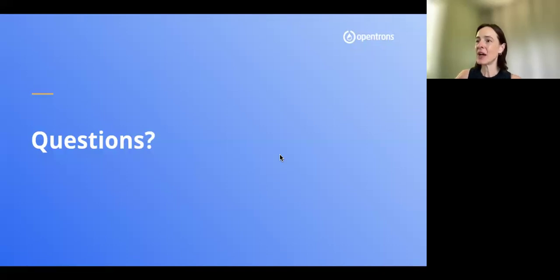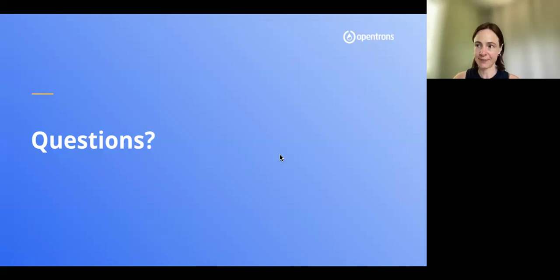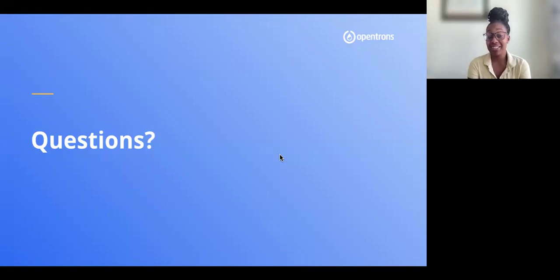What's the throughput difference between the OT-2 and the Flex? These are great questions, guys, so keep them coming. We don't have anywhere else to be. We've got another 15 minutes, but we'd love to answer these questions.